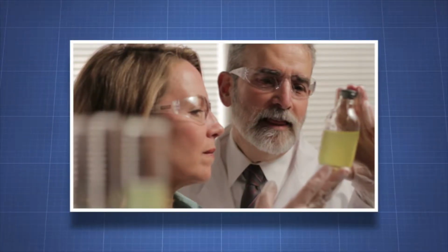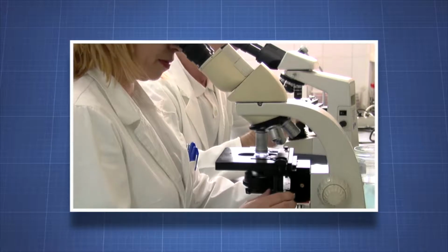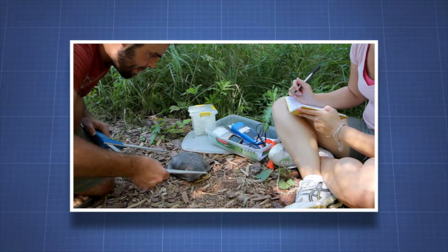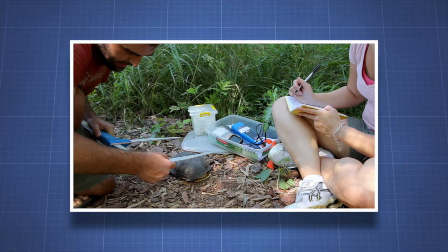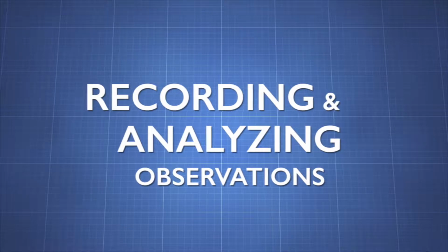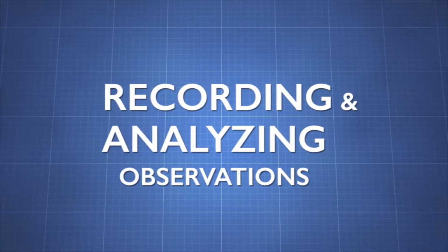Making observations is an essential step in the scientific process. An initial observation may prompt an important question. Observations are the foundation of testing hypotheses. Recording and analyzing observations is an essential step in any science lab or field experiment, whether in chemistry, biology, or physics. In this video, we'll explore the differences between recording and analyzing qualitative and quantitative observations.